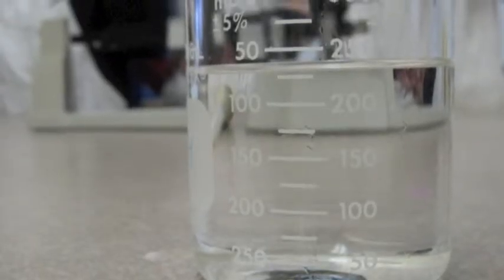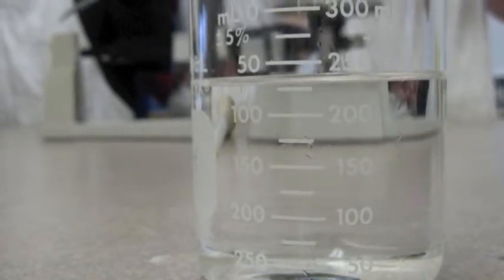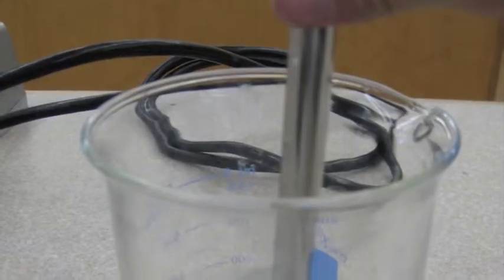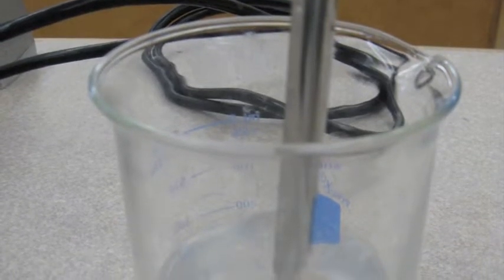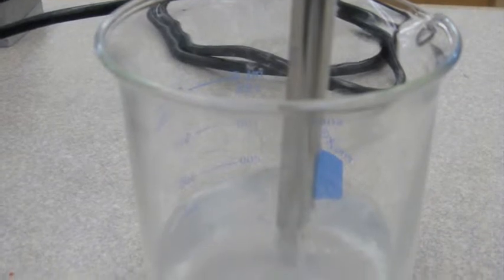First, use your spatula to measure out 4 grams of sodium hydroxide on the scale, and put 250 milliliters of methanol into the 500-milliliter beaker. Dissolve the 4 grams of sodium hydroxide into the 250 milliliters of methanol and mix with the spatula until dissolved completely. This process takes approximately 10 to 15 minutes.